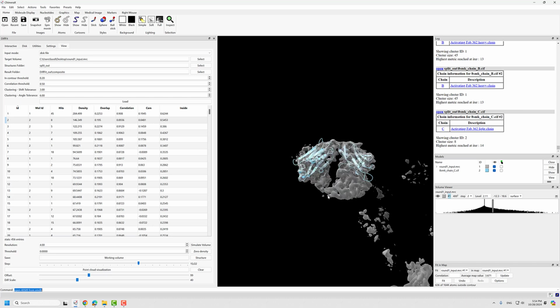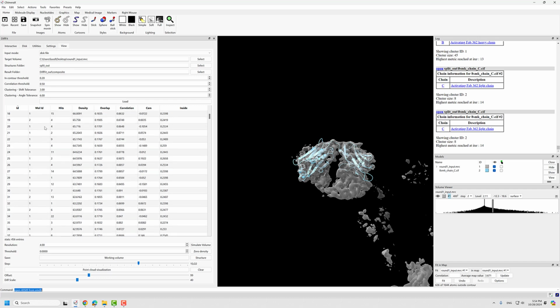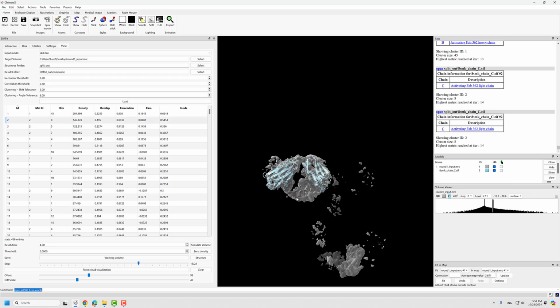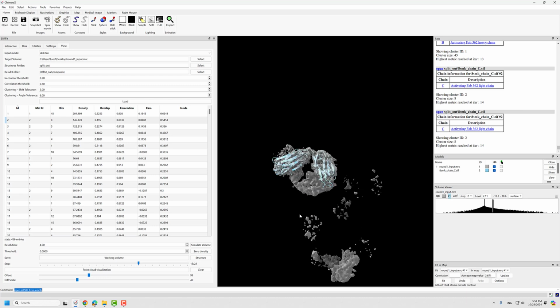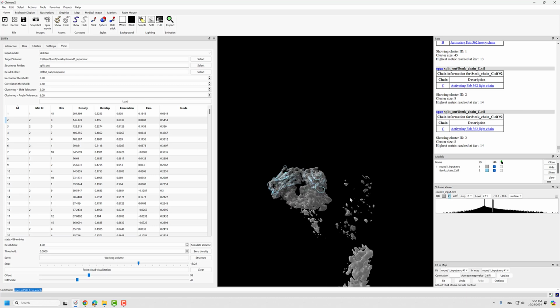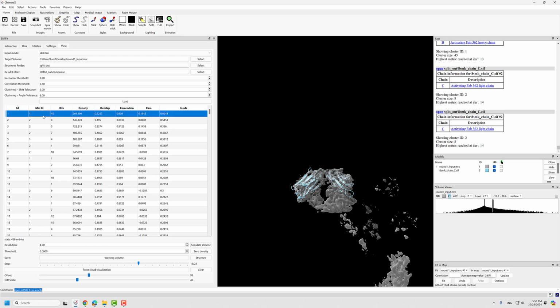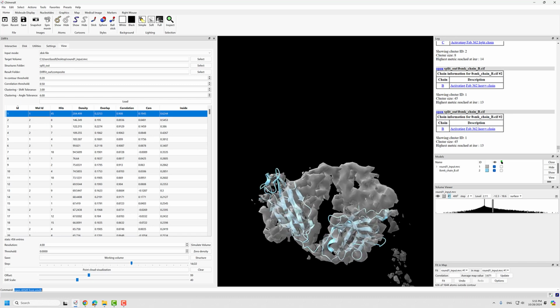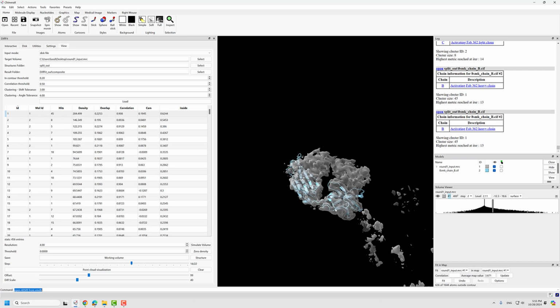Oh, holy! I made a mistake, I was looking at the bottom somewhere, so that's why it took me so long to differentiate which one is the correct one. So I was a bit puzzled just now too. The performance of DiffFit should be able to get the most correct ones at the top. Usually it is the top. So here it follows the density very nicely.